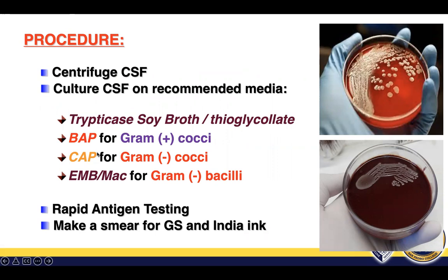We use blood agar plate for isolation of gram-positive cocci, chocolate agar plate for isolation of gram-negative cocci, and EMB and MAC for gram-negative bacilli. If we still have remaining sample, you can work with the supernatant and use that for serological testing. The remaining sediments can be used for gram staining as well as India ink.